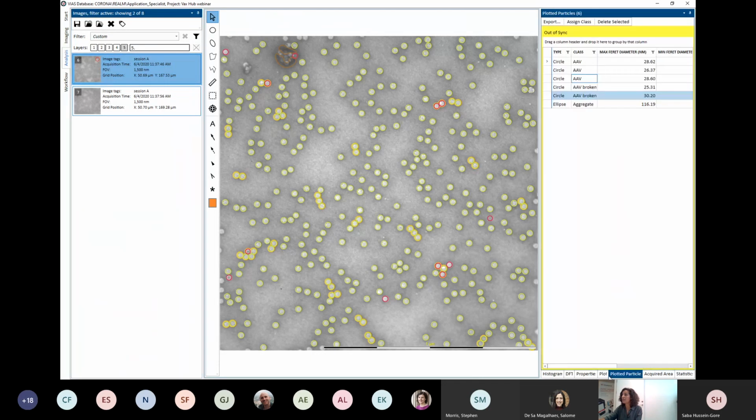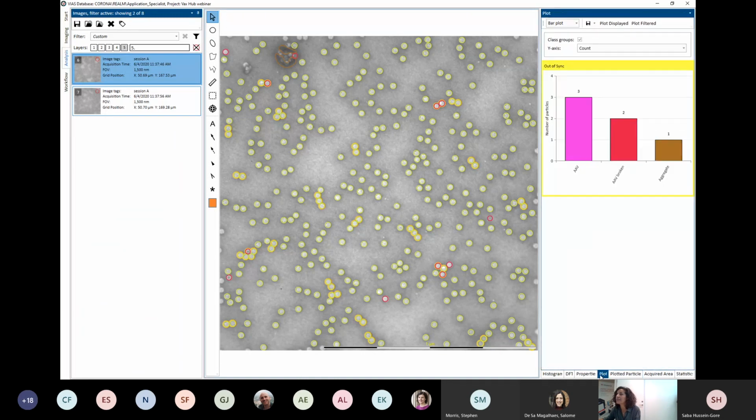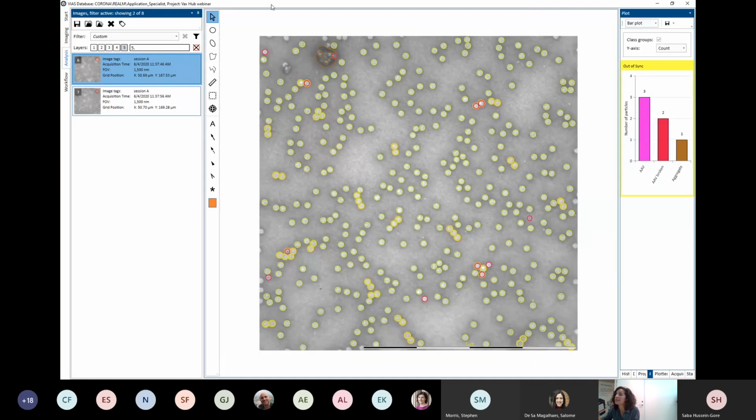And there is our analysis, or there is our image. And we can look at this a bit closer. So what can we see here? Can you guys see this well? I'm going to maybe zoom in a little bit as well. I'm going to make this like this.